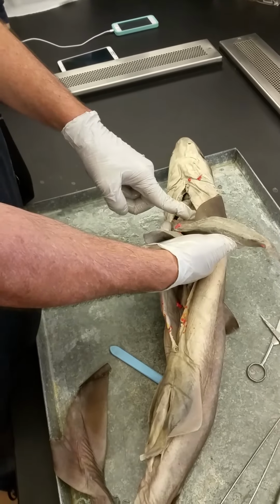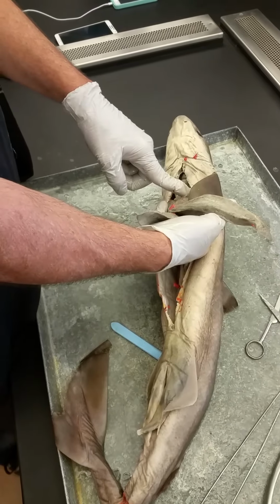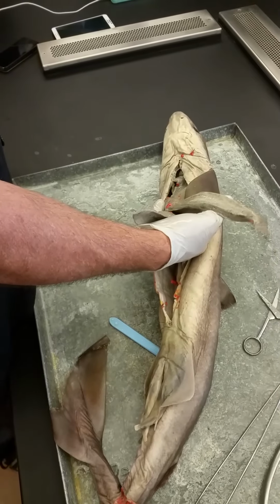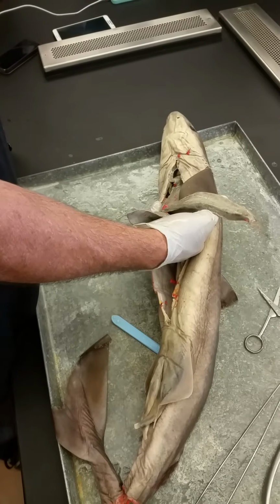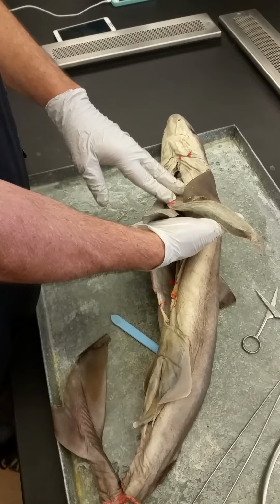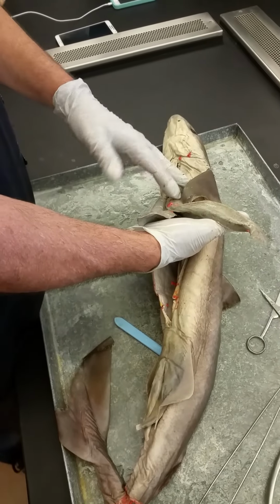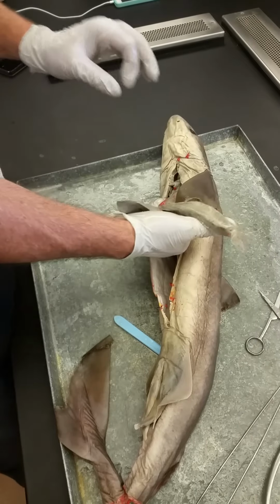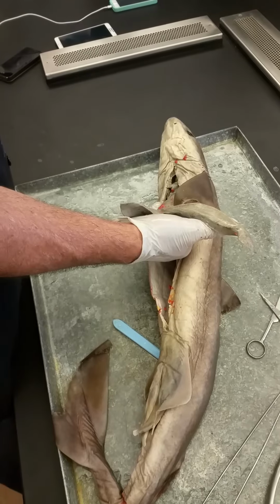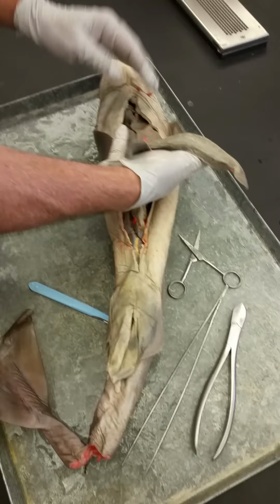Whereas if you use oil as your buoyancy organ, that's not going to change volume as you change depth. So a shark often hunts by either shooting straight at the surface or diving down and doing these big depth changes while it hunts. And so it doesn't have to worry about its buoyancy organ expanding or contracting. So it's much more amenable to an animal that hunts that way. Tuna is the same way. Tuna is a bony fish, doesn't have a swim bladder because it does a lot of depth changes when it hunts. But it doesn't have this huge liver.